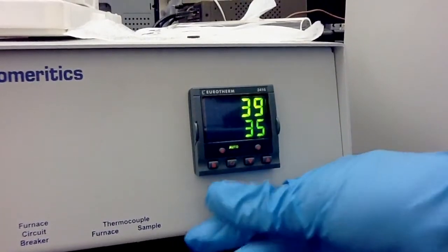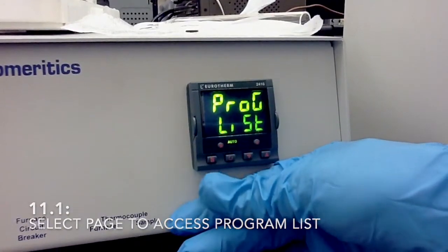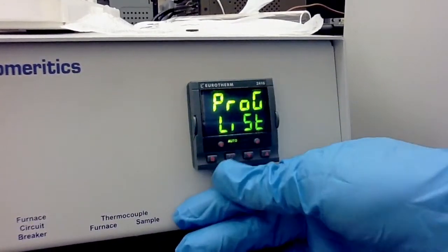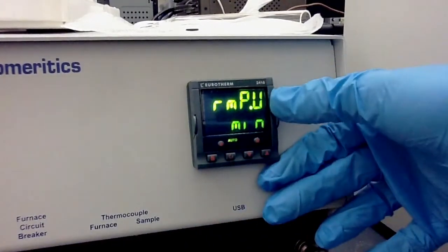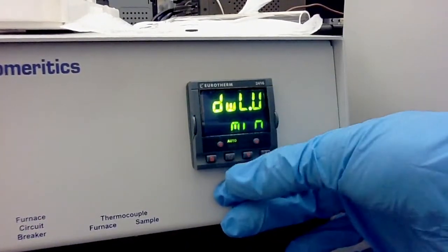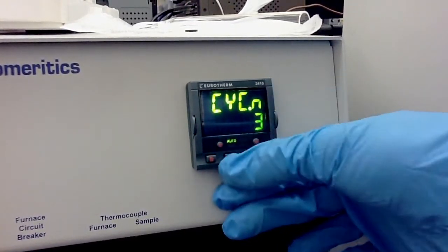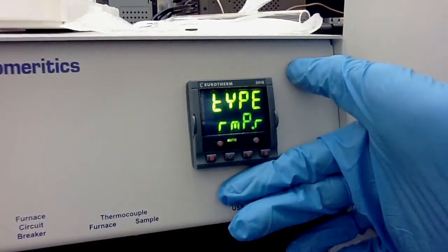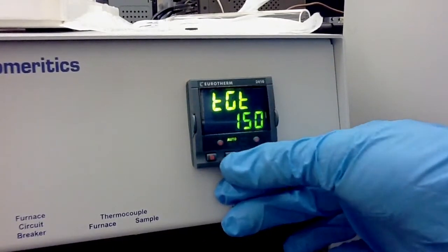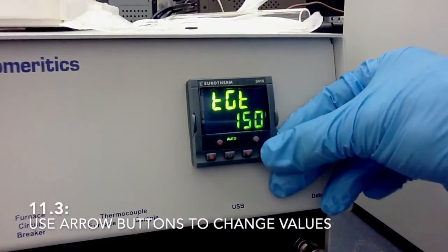To do this one, we go once again to paste program list, enter, and then it will ask ramp unit is per minute, dwell unit is per minute, segment is 3, and the first segment 1, which is the ramping type, and what temperature, it says 150, but for my experiment I need 800.